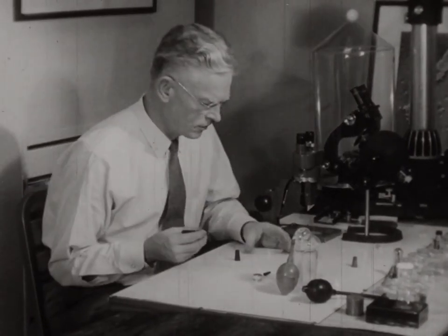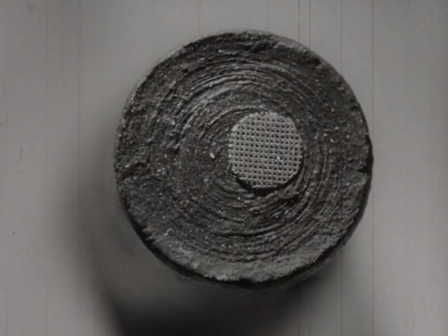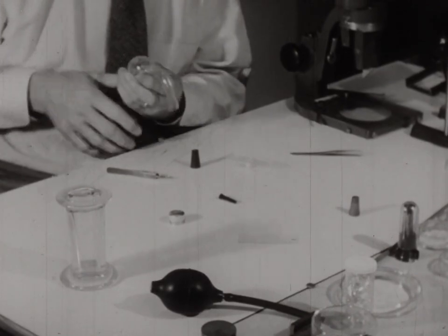We have first of all to prepare the specimen, and this is done by taking some very tiny copper grids which are filmed with collodion, and then we take the virus solution and we spray onto this grid the suspension of viruses, let's say tobacco mosaic virus.